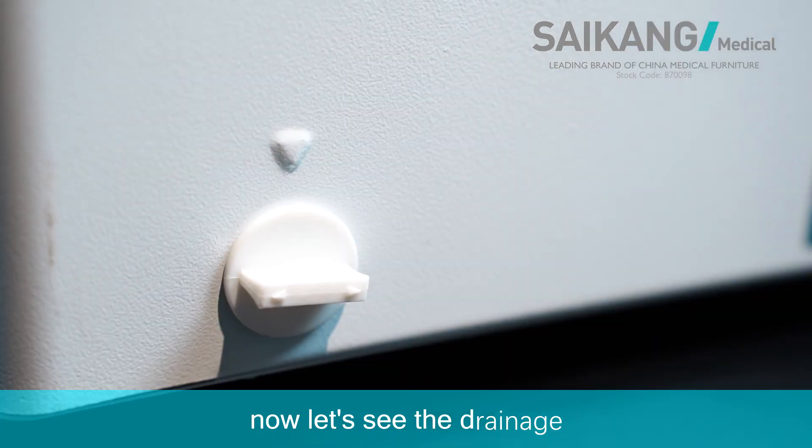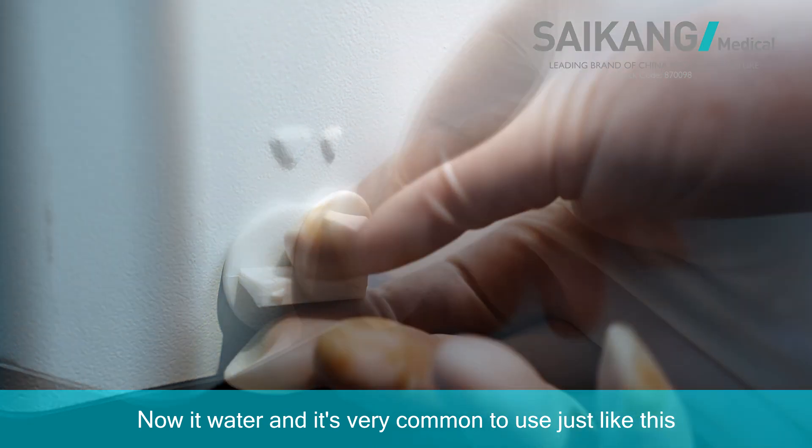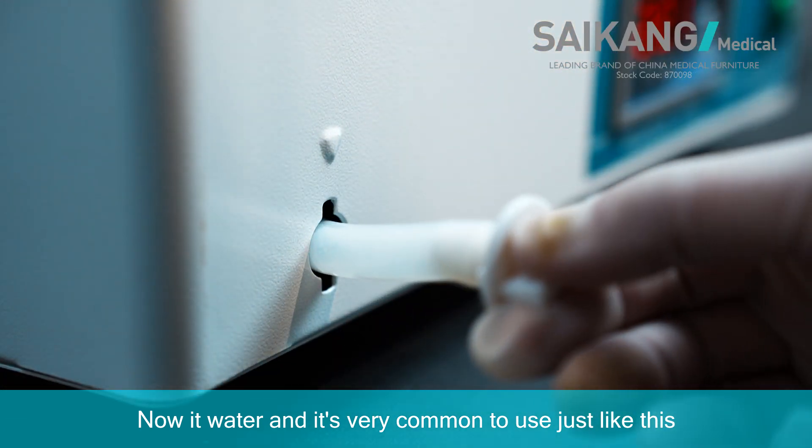Now let's see the drainage. The plug has very good sealing performance — does not leak water, and it's very convenient to use, just like this.